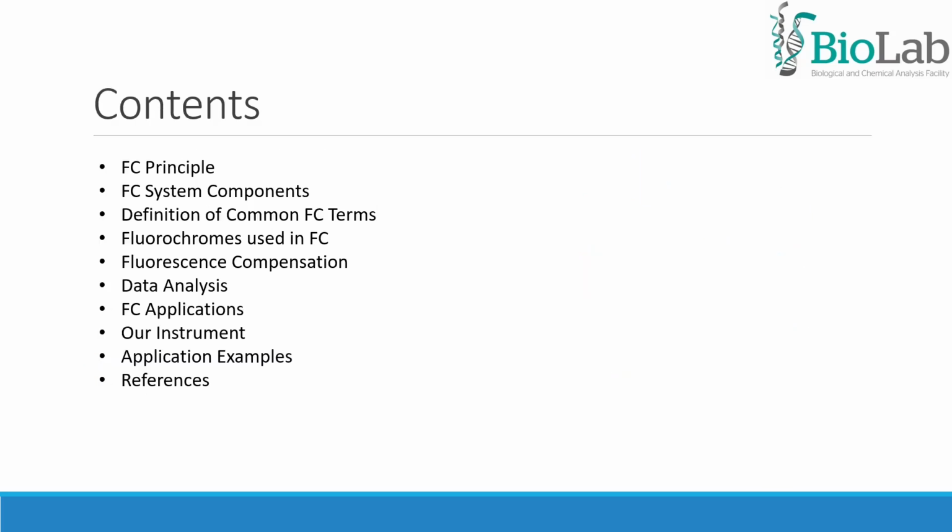In this presentation, I will talk about the principles of flow cytometry, the major components of a flow cytometer. I will define some common FC terms, present some fluorochromes, discuss fluorescence compensation, and data analysis. I will also present to you the instrument that we have in our facility and give some application examples.